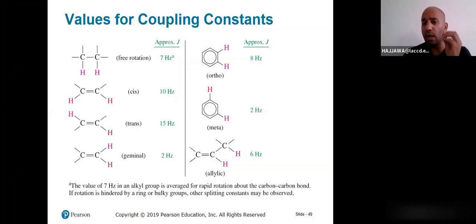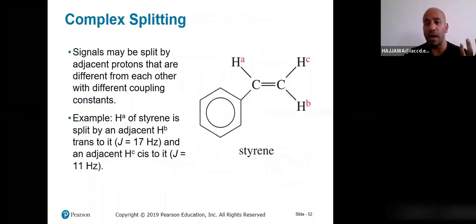So this coupling constant is sometimes really useful in a case like this one, styrene. What do I have?